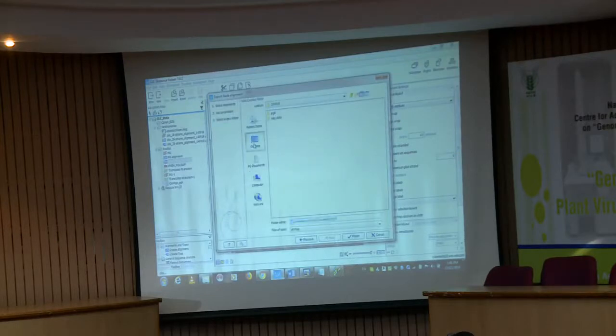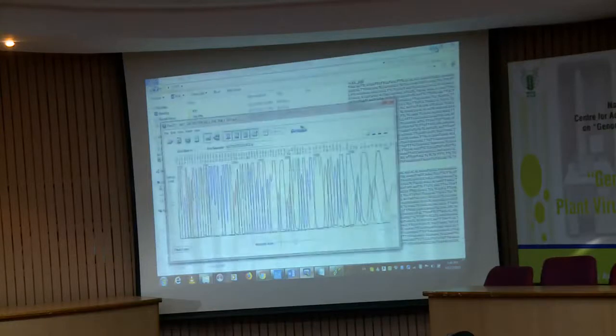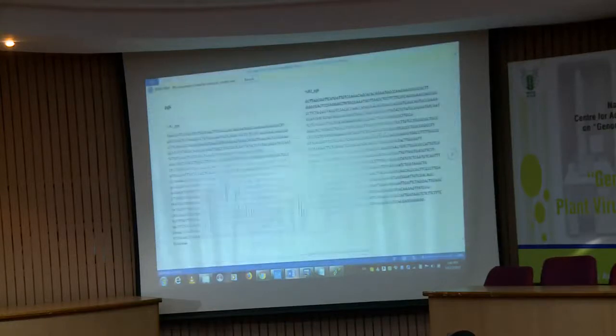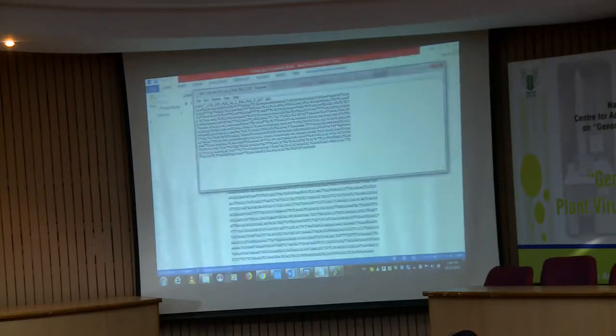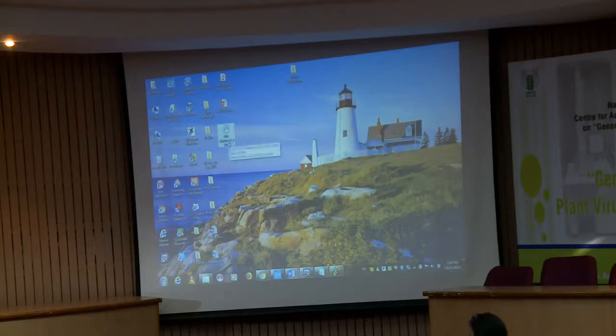just to show you, I am downloading it to desktop only. So here that file has been exported. The edited version will be exported for you.